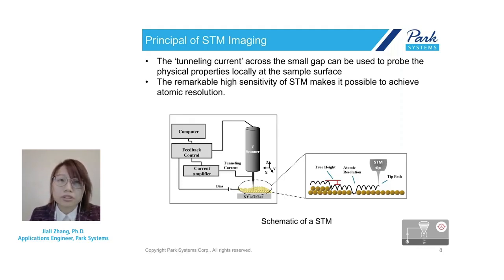And STM is also an important tool in research surrounding semiconductors and microelectronics. Despite this super high resolution of STM, there are huge obstacles that prevent the prevalence of STM, such as the cost and complexity of STM systems.